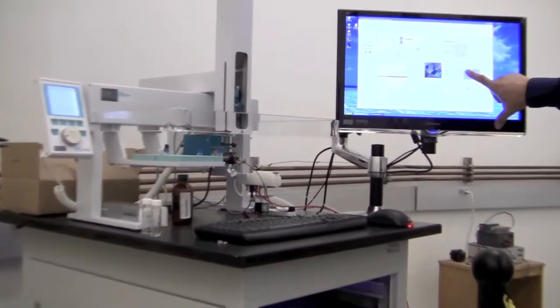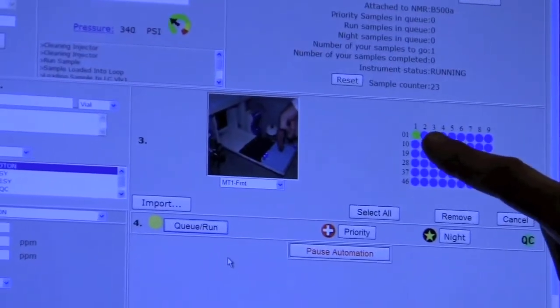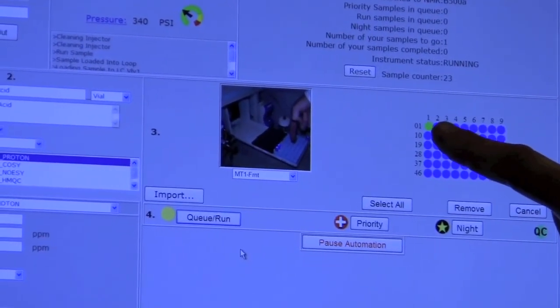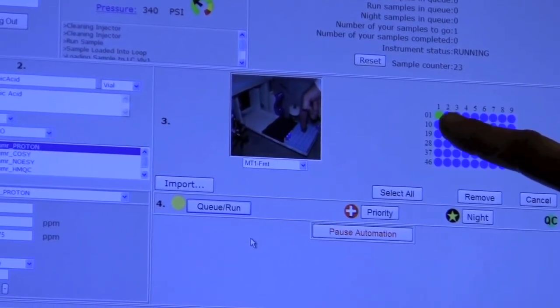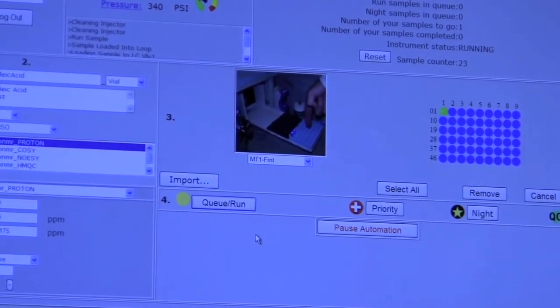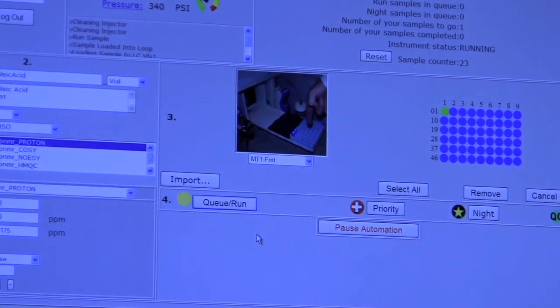On the screen here, it shows a flashing FID. This means that it's running, although it may not actually be acquiring data yet. But when it's finished, this flashing icon will change to red, which means that the sample has finished. Once it's finished, you can log into the spectrometer the normal way and access your data using SFTP, just like you would on any other NMR spectrometer.